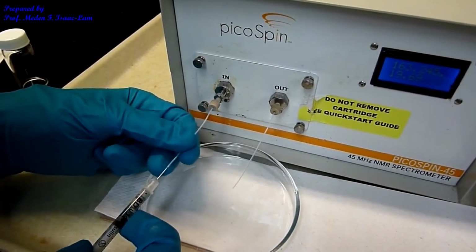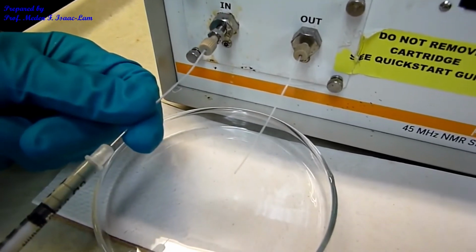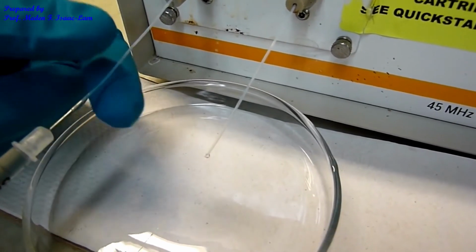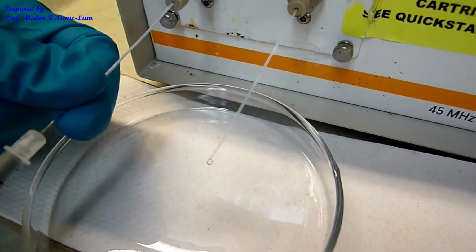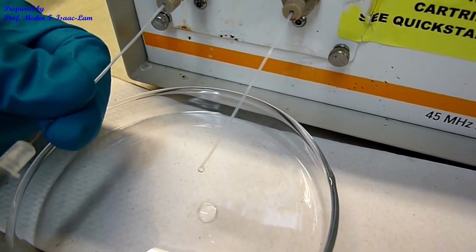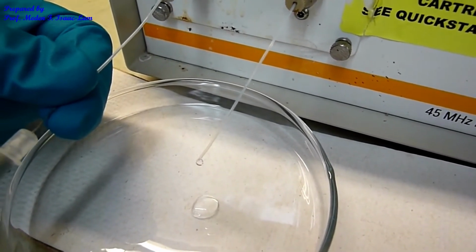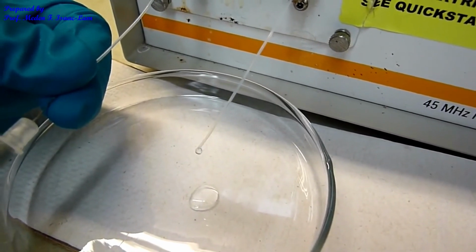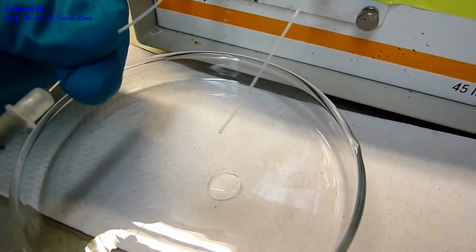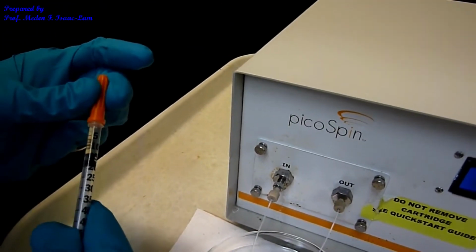There's a Teflon tubing, and then I slowly push it so that, watch the drip. So I wanted about 8 drops. So I have enough in case I need to inject more later. So I will just cap it.